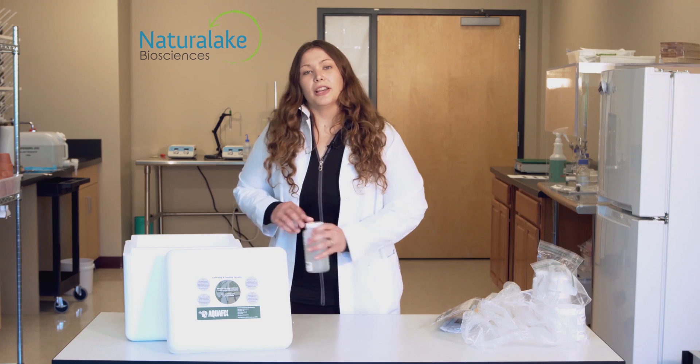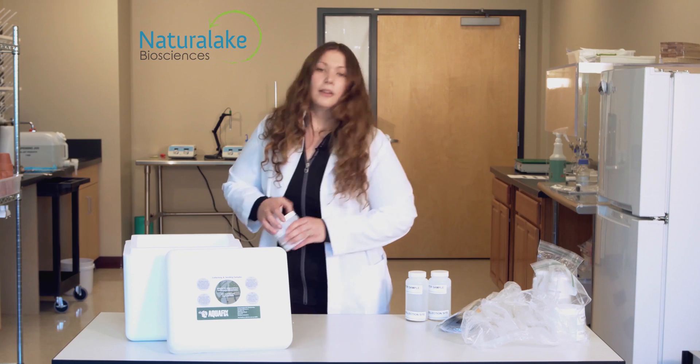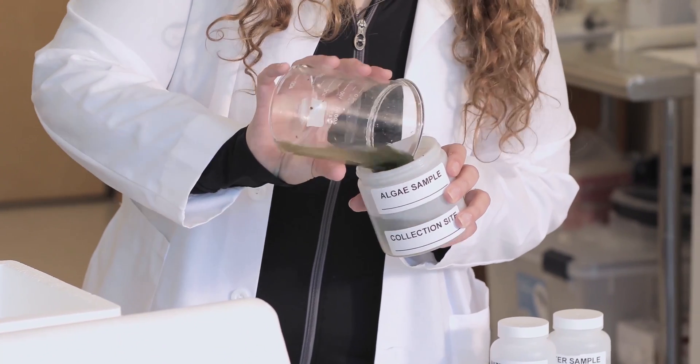Fill your water collection bottles three quarters full, making sure that you leave air space. Fill your algae collection jar with your sample. Please add water to help preserve the sample during shipping.